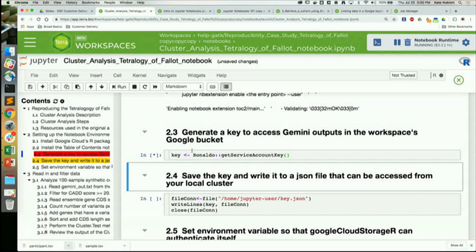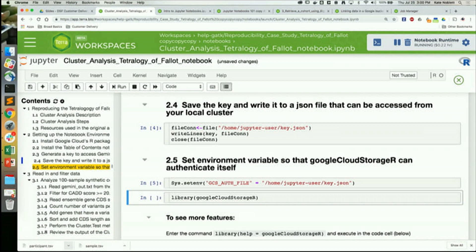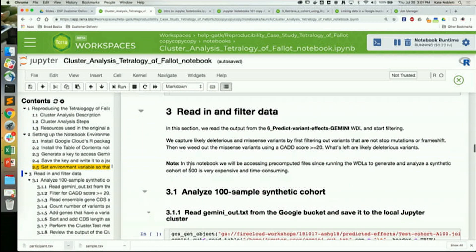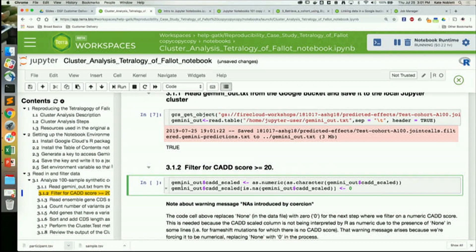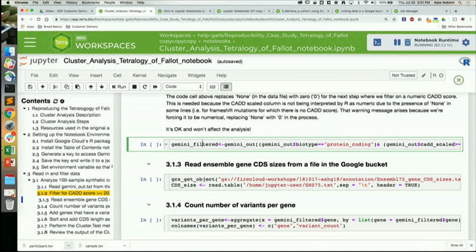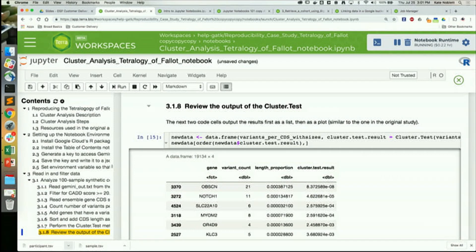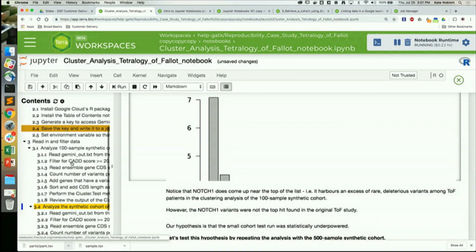One thing useful to point out: you may see a pink warning that isn't actually bad. A lot of people get worried when they see pink or yellow text, especially if it says 'warning'. Don't worry about that — just because it gives you a warning doesn't mean the cell didn't successfully compile. If it failed, it will give you a specific error message. I like to go through cells one by one the first time to make sure nothing went badly.